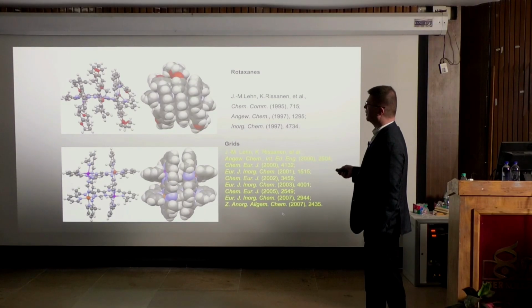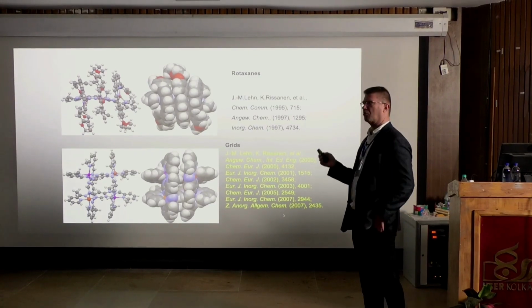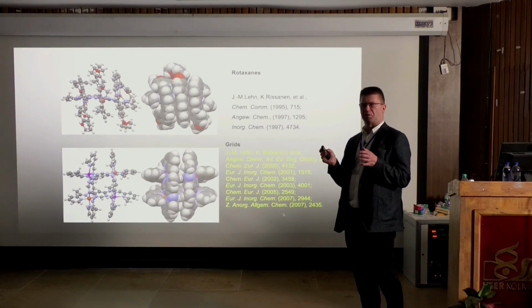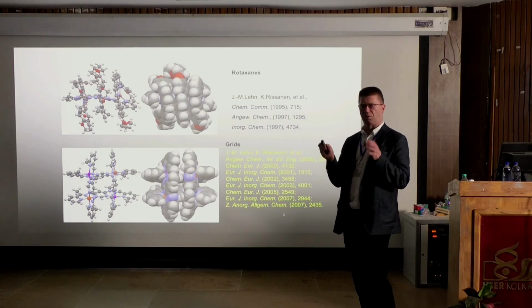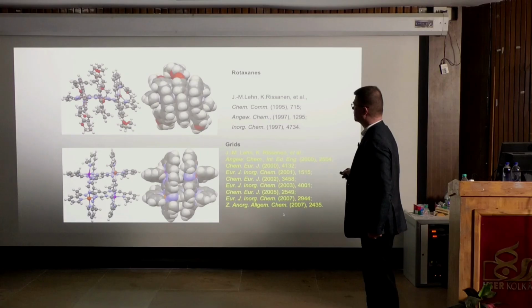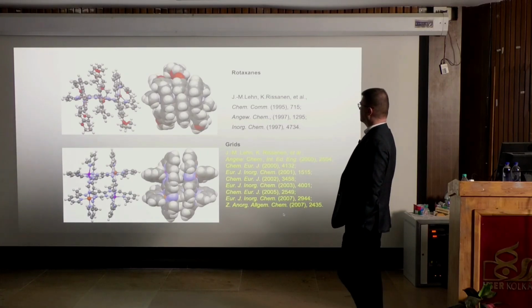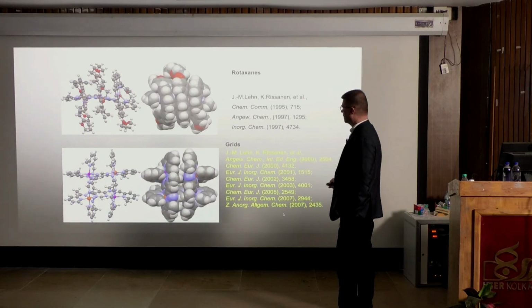And you can see here, this always gives you a slightly different opinion of this, but that is how it really looks. So it's a really compact structure. So nature normally, especially in a solid state, doesn't like vacuum or empty space. So the molecules normally have to touch themselves, and that's what happens here. And there's pi-pi interactions within these. So we did quite a lot of work with Jean-Marie on his rotaxanes.